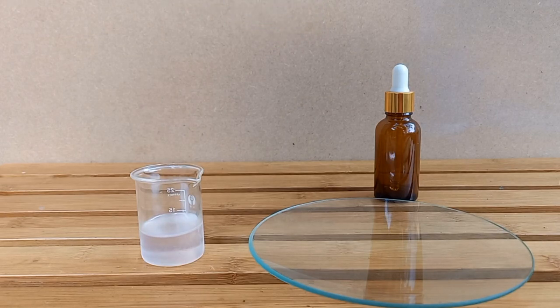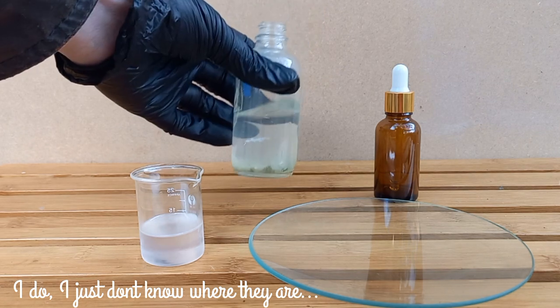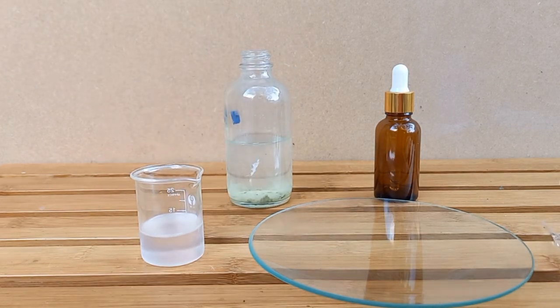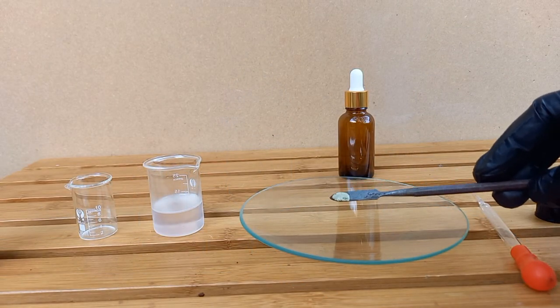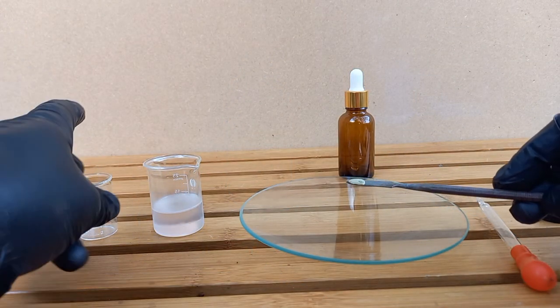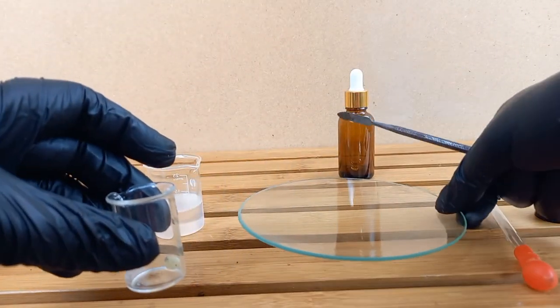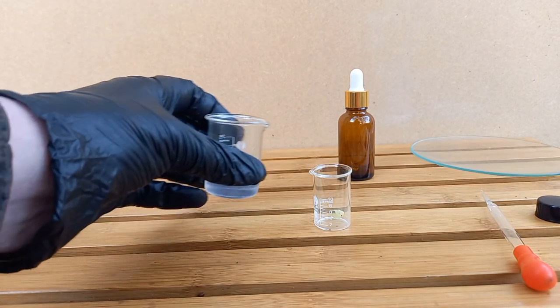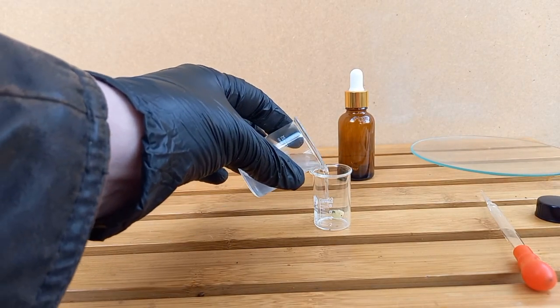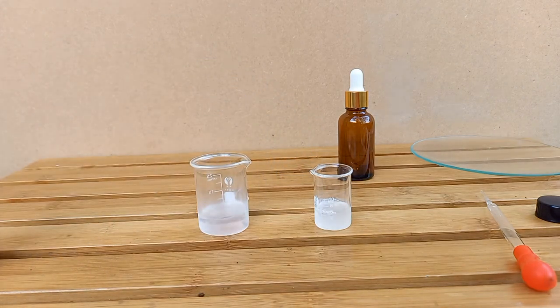I need to pick that up but I don't have tweezers — give me a minute. Here is a piece of white phosphorus which we're going to place into here. I add some carbon disulfide; it should dissolve the white phosphorus.